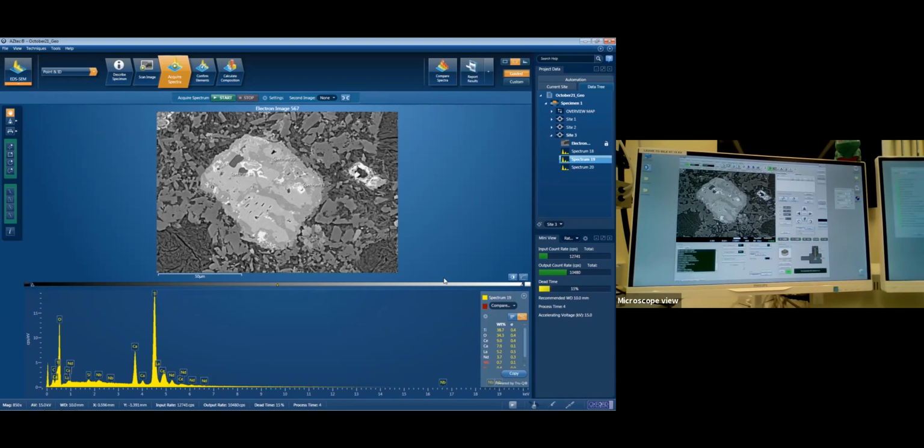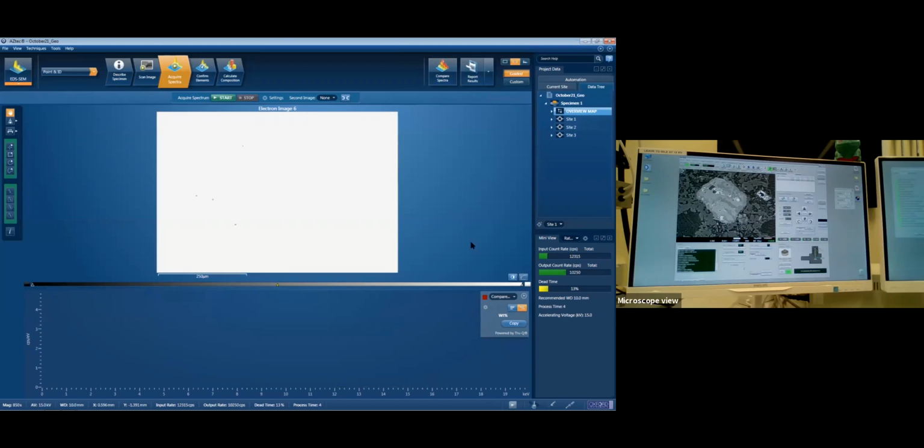As all geologists, we work on a very small group of rocks individually. You show us something that isn't one of those, and we've got to start from scratch. And neodymium. So maybe it's a mine sample, so those rare earth elements could well be in there. In this particular rock, it doesn't look like they're in great enough quantities for us to have the patience to get them out of there. But interesting nonetheless. But let's go back to the big overview map.